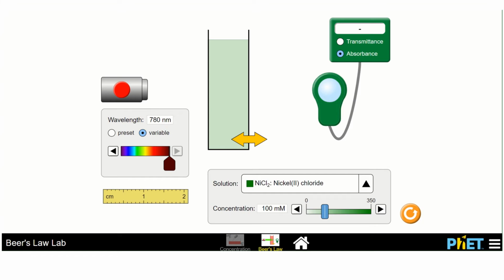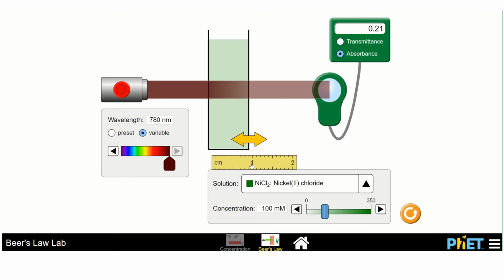So from there, you're going to start the light, and notice that now it's on and you are measuring absorbance, right? And just for reference, we have a 1 centimeter cuvette. So that was step 4. And like I said, always take it step by step. So step 4, we switched on the light.